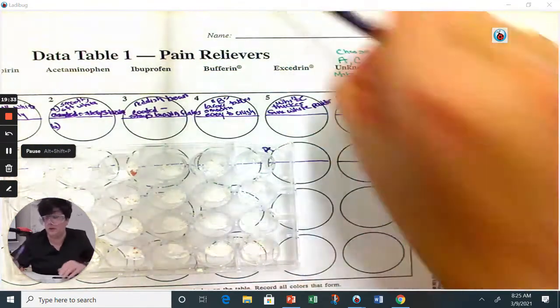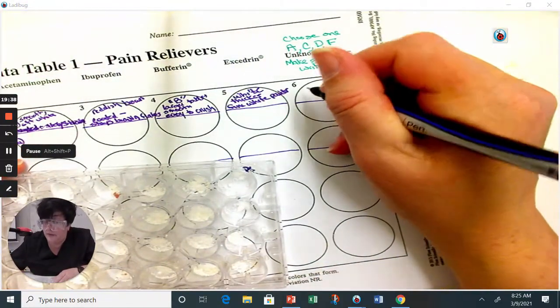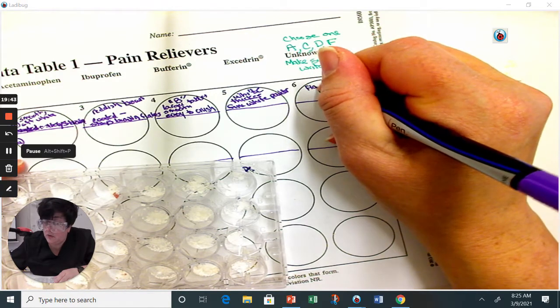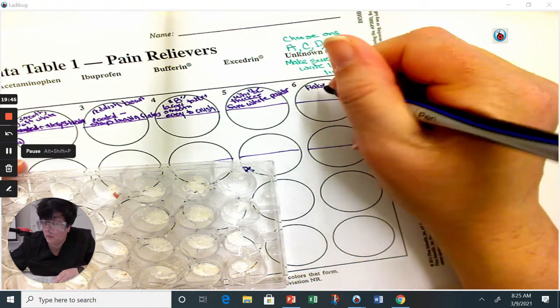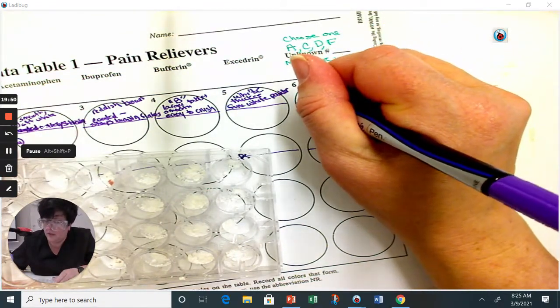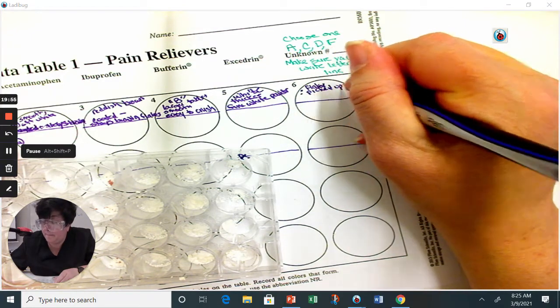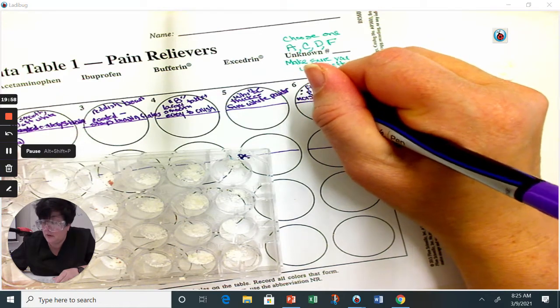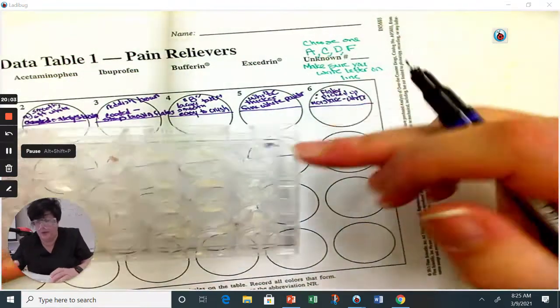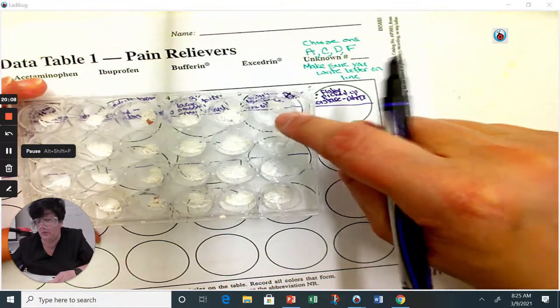Okay, so I'm just going to leave this right near, and then I'll put the other table together in a second. All right, so for this one, it's flaky. Oops, I forgot the E. Looks like it's picked up moisture, meaning it's a little chunky. It's white. There's no color in it. So by appearance, I don't think it's ibuprofen because there's no colored flakes.